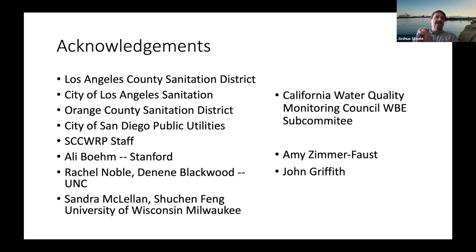But honestly, I think part of its benefit is you're really counting positives and negatives. So even if you're inhibited, if your positive is not 5 times higher than your negative, but is only 2.5 times higher than your negative, you can still distinguish it and count it as a 1 versus a 0. And that's a benefit of digital PCR, and not just in wastewater. When we've applied it in stormwater and other really difficult matrices and environments, we've found it to be a little bit more robust.